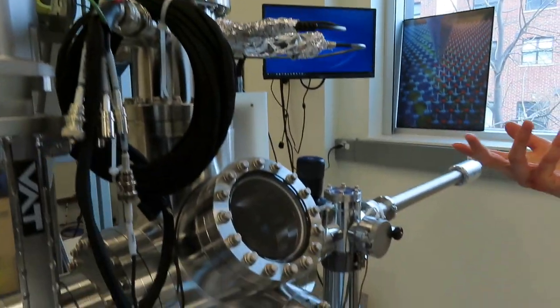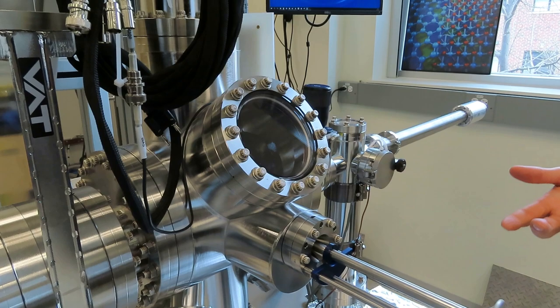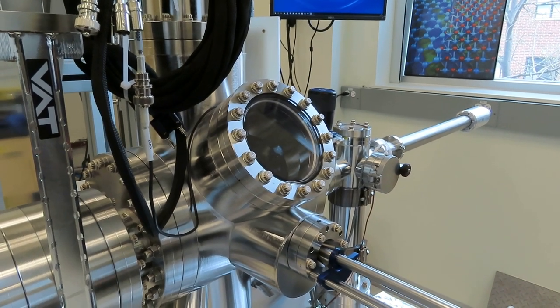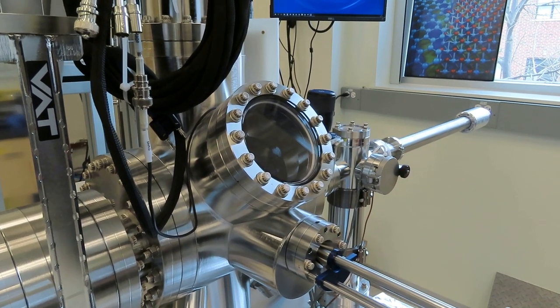In practice, we can't get 8 Kelvin because you lose a little bit of temperature between the cryostat and the main body, but in practice this means we can take data at temperatures around 9 Kelvin, which is not as cold as some systems, but it's still very cold and allows us to take high quality data with this instrument.